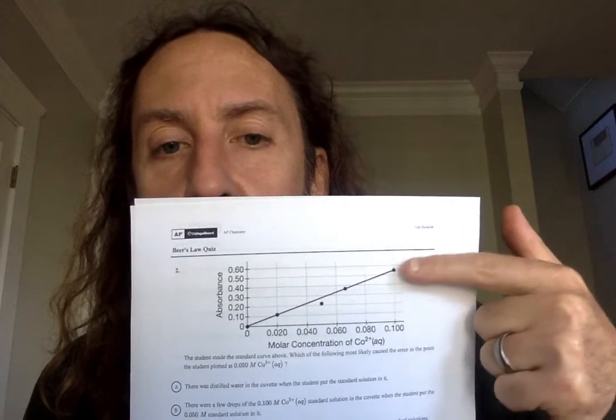So my choices are, A, there was distilled water in the cuvette when the student put standard solution into it, and this is most likely. B, there were a few drops of the 0.100 molar cobalt chloride standard solution in the cuvette when they put in the 0.05. That's not going to work because the 0.1 would have caused the dot to jump up above, because it would have been more concentrated than the 0.05.